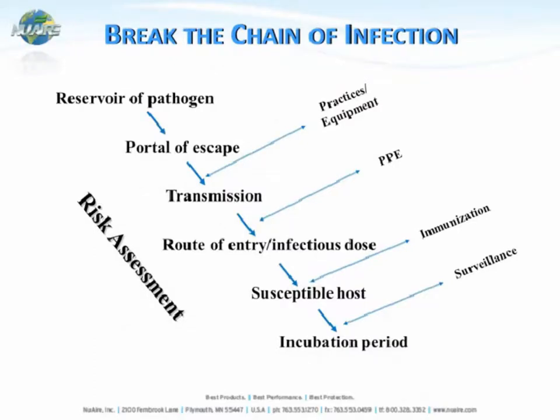When looking at the chain of infection, the reservoir is the habitat where the agent normally lives, and the portal of escape is the path by which the pathogen leaves the host. Transmission can be direct through contact, or indirect via airborne routes — practices and equipment are used to guard against that. The portal of entry is the manner in which the pathogen enters the susceptible host, and we guard against that by using PPE.